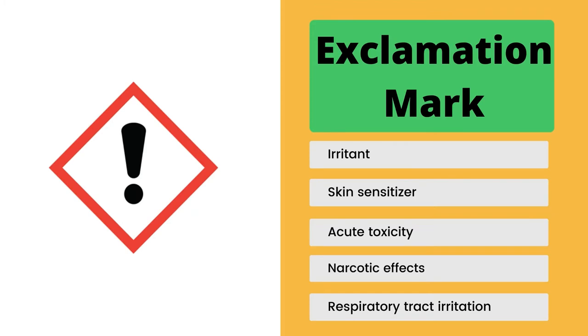Exclamation mark. These chemicals cause health problems, usually less toxic than chemicals labeled with the health hazard or skull and crossbones pictograms. This pictogram is also used for chemicals that can destroy the ozone layer.